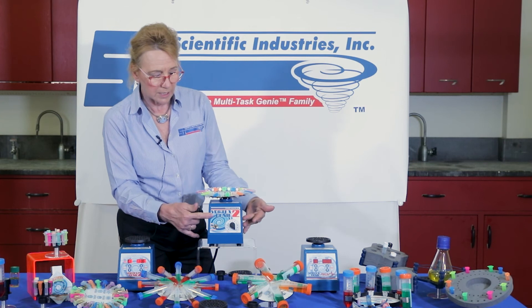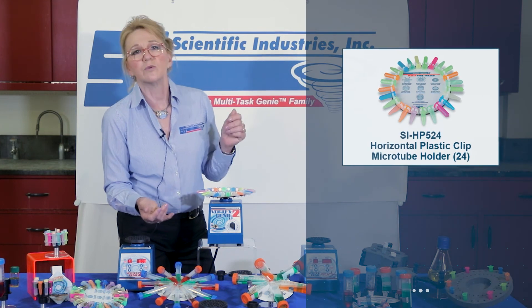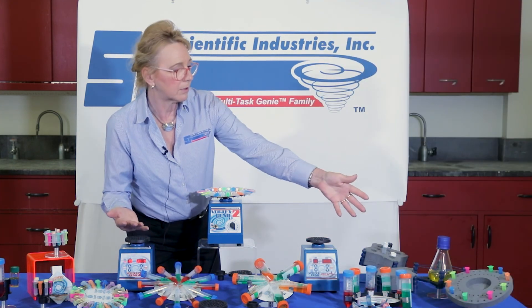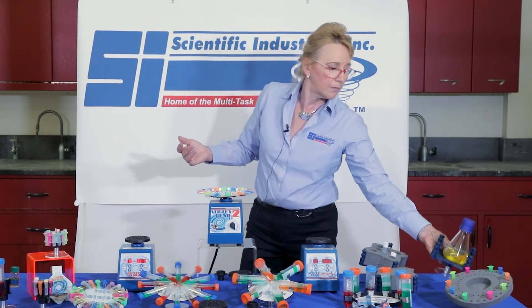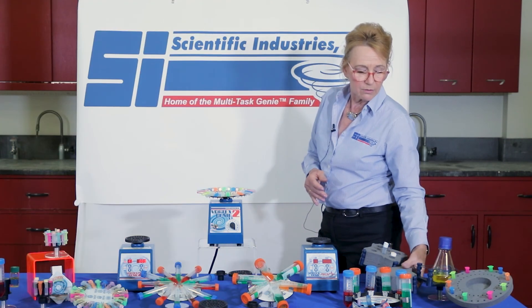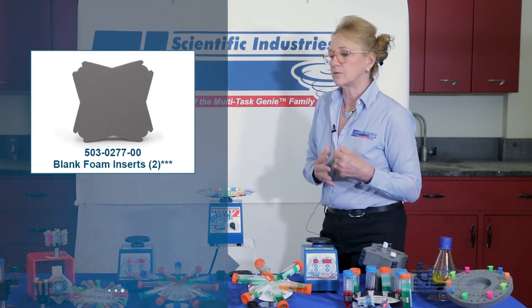As you can see on the Vortex Genie, I have a 24-place micro tube holder, which is typically used for packaging kits for extraction methods. For other types of bead beading or vortexing, we have different vessels. You can even handle a flask to vortex a single flask. You can also customize with our blank foam insert depending upon the type of tube or vessel you have.